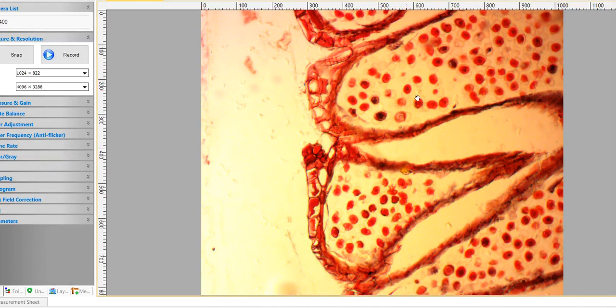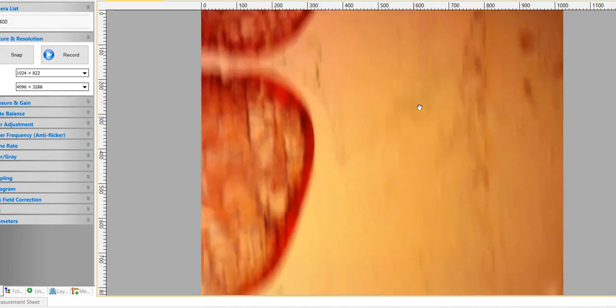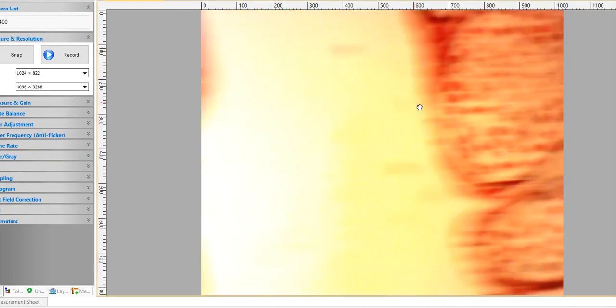We're seeing some dots here. Those dots are usually nuclei, so we'll see if that's nuclei. In fact, we might have some mitosis going on. A little preview. Okay, so let's find one that looks kind of interesting. Let's look right in here. We got something interesting here. So I'm going to move that down. Oh, unless I go the wrong way.